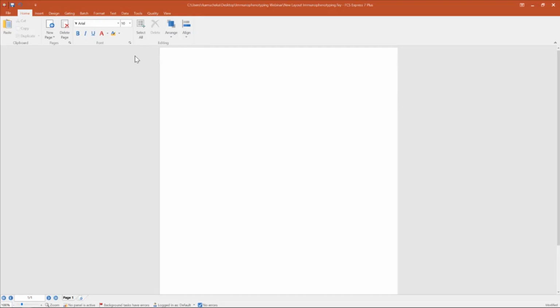So inserting plots or text boxes, using alignment features, formatting text is all something that we have likely used before. Similarly to PowerPoint, everything that you put into the FCS Express workspace is formattable. So I'm going to go ahead and start by changing the orientation of my page.